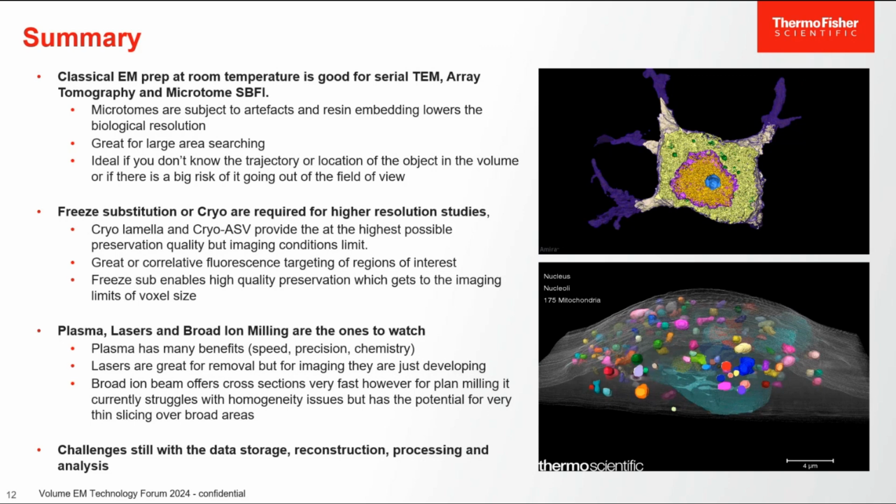Hey, John. I'm wondering, is there any development going on about spin mill in cryo? If you want it, you can do it, pal. No, there's no reason why spin mill won't work with cryo samples. You need to have concentric rotation for our spin mill method, but provided you have a flat sample that allows concentric rotation, that's fine. I.e., no pre-tilted shuttle. You want to have it mounted flat. That's the easiest way.